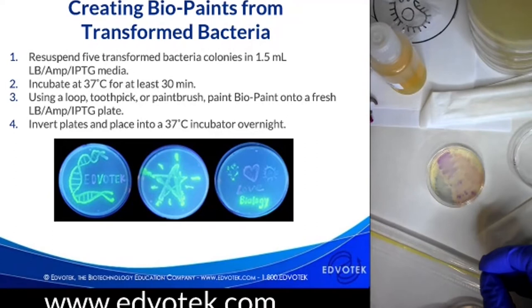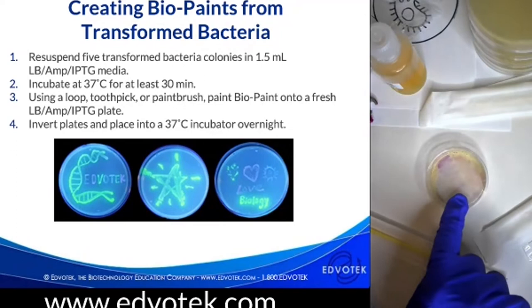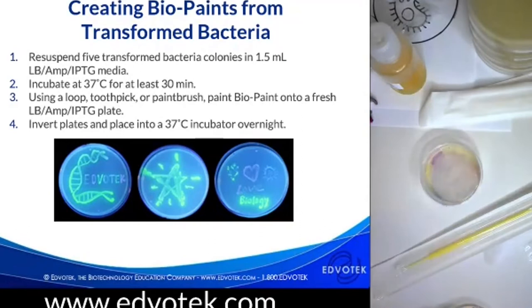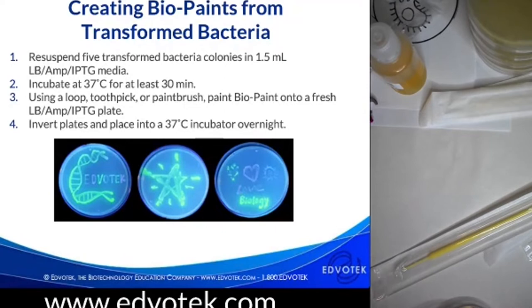You're going to incubate your biopaint at 37 degrees for at least 30 minutes. And then you can use a loop, a toothpick, a paintbrush, or a micropipette to take this paint and apply it to the prepared plates. In the demonstration, I'm going to show some of the methods using our Bacto beads. One of the things that educators did ask for is that, so this scenario is using biopaints from bacteria that you may have transformed yourself.